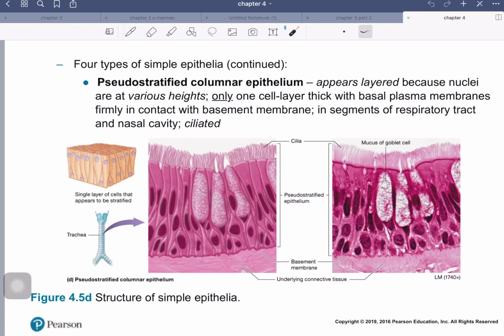Let's look at one of my favorite types of cells since we're here. These right here, you see they look different inside. These are what we call goblet cells. And what we have inside here is mucus. And it makes sense because where these cells are located, like the respiratory tract, they release some mucus that helps to trap particles, and the cilia move the mucus along. So these are goblet cells, these specialized mucus producing ones. Why? Because someone thought they looked like a wine goblet. And remember, in the world of histology, they called it like they saw it.